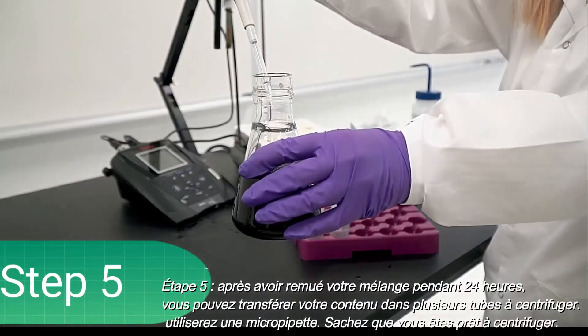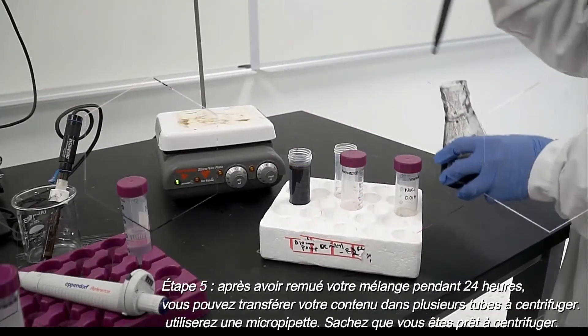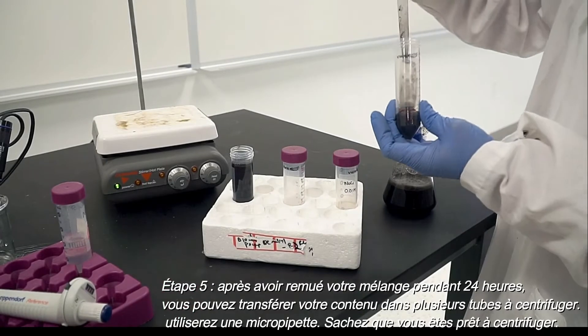Step five: after your mixture has been stirring for 24 hours, you can transfer your contents into multiple 50 milliliter centrifuge tubes using a micropipette. Now you are ready to centrifuge.